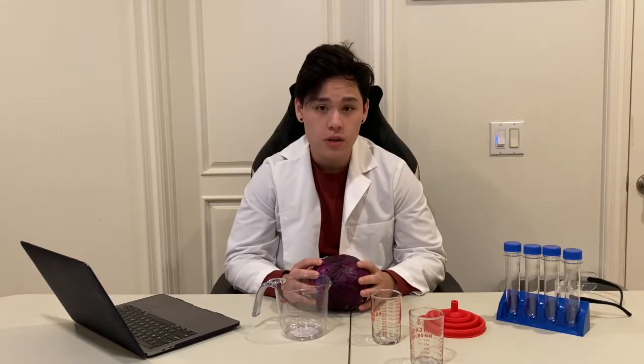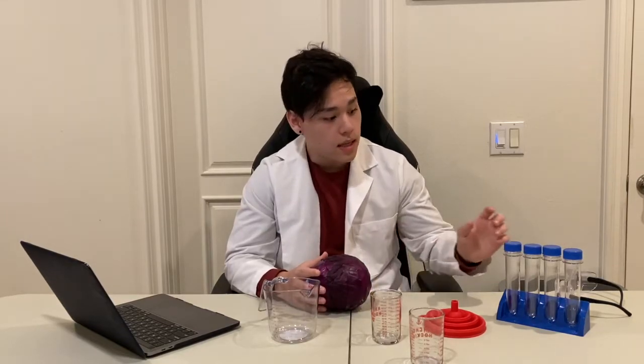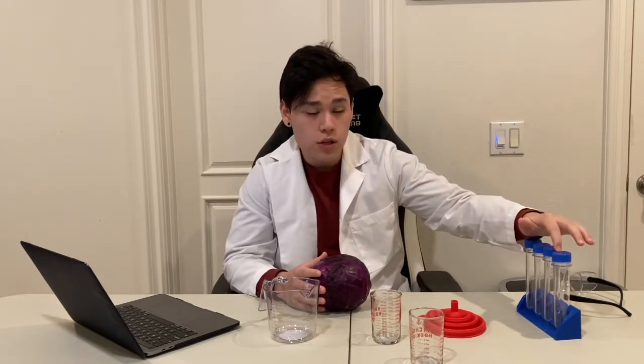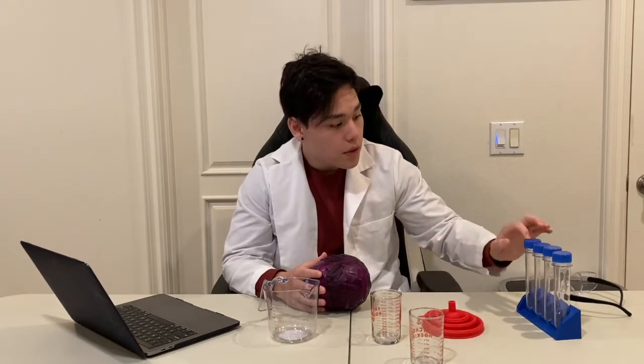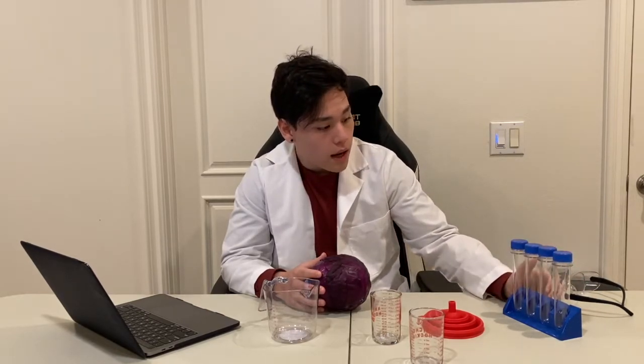Next we're going to let it cool to room temperature, strain the large bits of cabbage, and then take the water from the pot and funnel it into a 500 ml beaker. This beaker will then be placed in an ice bath and filtered through a coffee paper filter with cold water. Then we're going to put that water back in the pot and let it sit for about 30 minutes on low heat to evaporate the water, giving us a concentrated amount of anthocyanin. That can be placed in each of the four test tubes, about 25 ml each, and then we add two to three drops of each of our six percent household cleaning products and analyze the results.